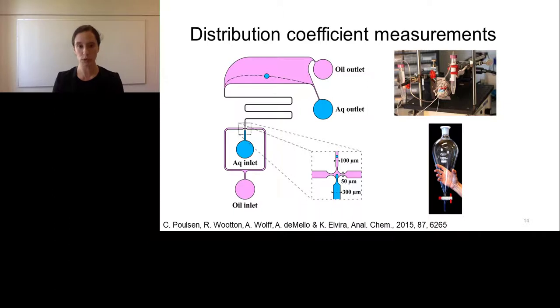But what we also wanted to do was show that we can make microfluidic devices not out of PDMS, that first image that I showed you right at the beginning of my presentation, but using a commercially viable technique called injection molding. Loads of the things that you have at home that are made out of plastics are made using injection molding, but not so many microfluidic devices have been made this way. We want to just show the capability of this system.